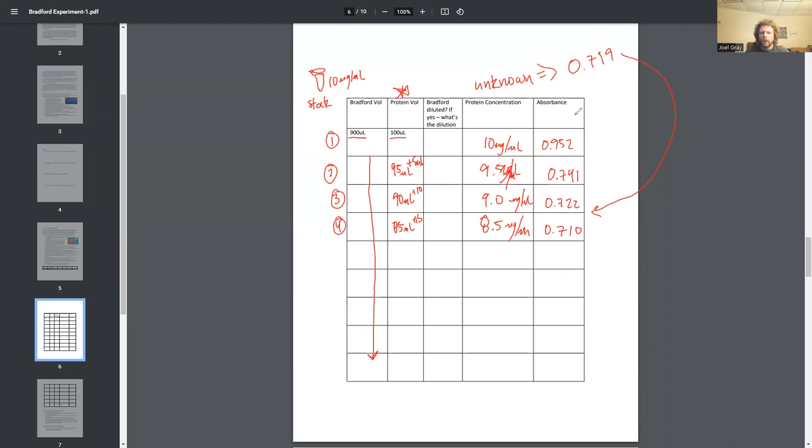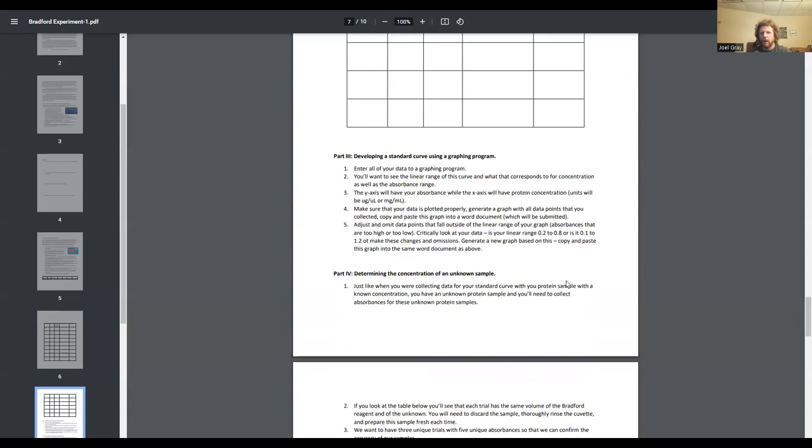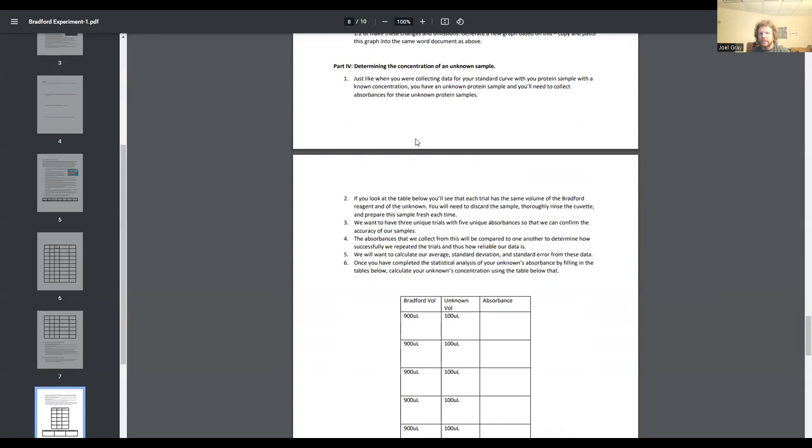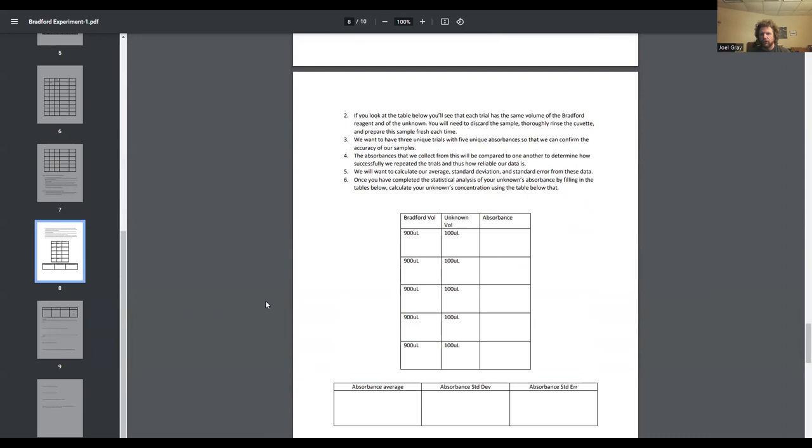Now, with that in mind, this data sheet, if you'll notice, has a very good number of samples to analyze. You do not have to fill that data set up. You're going to use a graphing program. This is something you probably want to do on your own time using Excel. And then you're also going to have an unknown sample. That unknown sample, if you look at the bottom here, what you're going to be able to do is take that sample with the unknown protein concentration and plug it in.